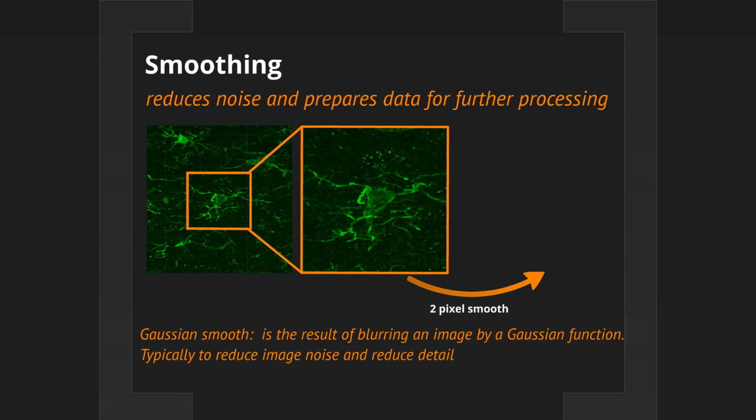Okay, so I'm going to point out some of the more commonly used, some of the ones that I highly recommend. One is a smoothing filter. I'm sure you guys use smoothing filters in Fiji and all over the place, really. But smoothing filters, when you are bringing in 3D data, can be incredibly useful, not just for making the image look better, but for the purpose of segmentation, can make your life a lot easier. If you have a tremendous amount of pixelation and a tremendous amount of noise, it's going to take longer to generate and segment and threshold your data. Okay, because you're going to have all of this noise to contend with.